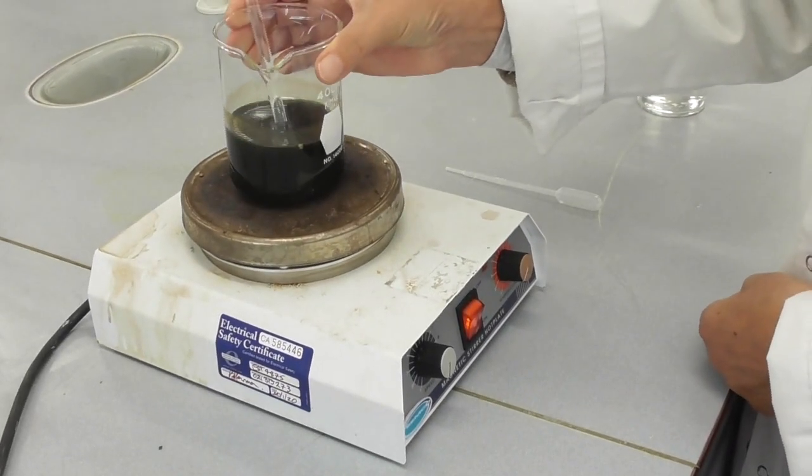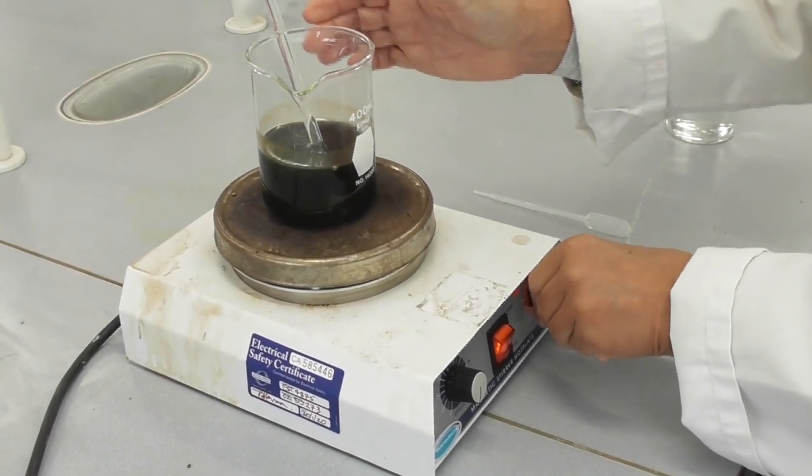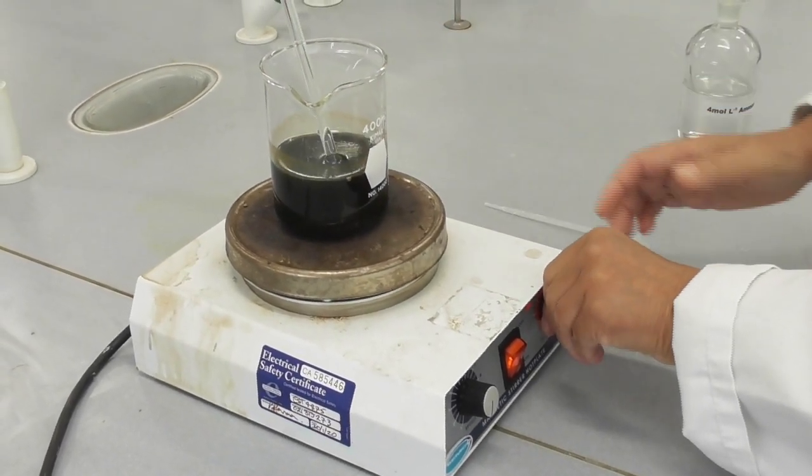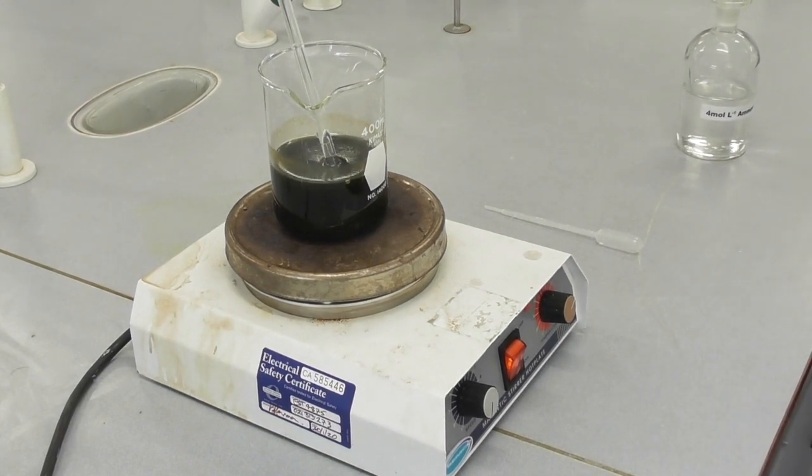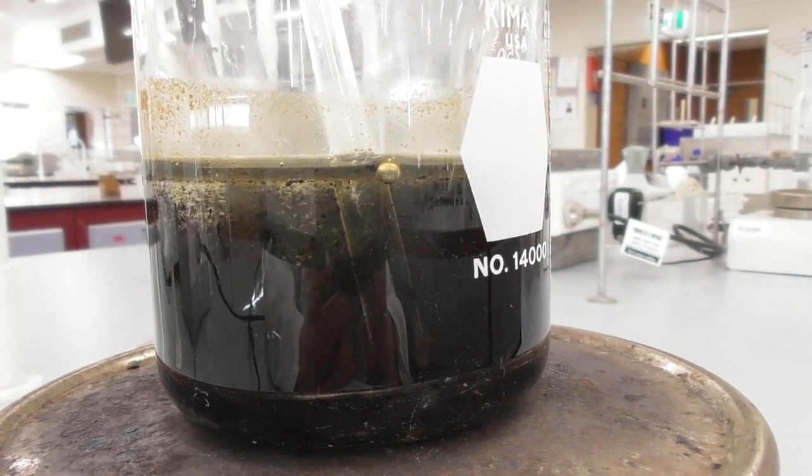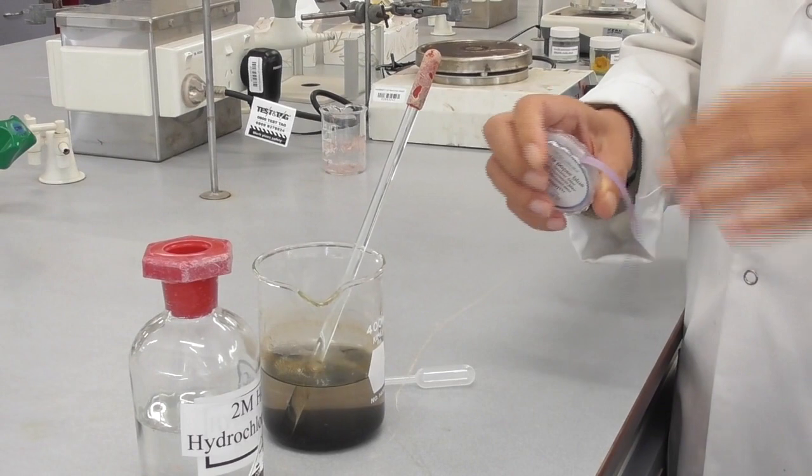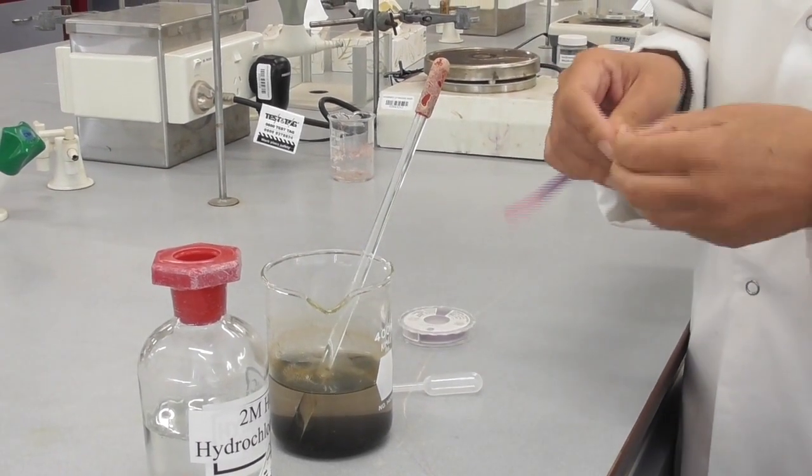To help the magnetite coagulate I put the beaker onto a hot plate and heat the solution to just under boiling temperature. Here we can see the magnetite coagulating and settling at the bottom of the beaker.